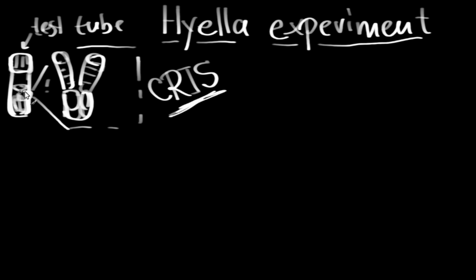And what we're gonna do with this test tube and with this biomass after the light experiments, we're gonna run HPLC analysis for pigment composition analysis and lipid profiles, and we're actually gonna see what we're gonna do with that later on. But for now, we need to basically know how it's growing under the different light conditions. For that, it's chromatic adaptation basically.